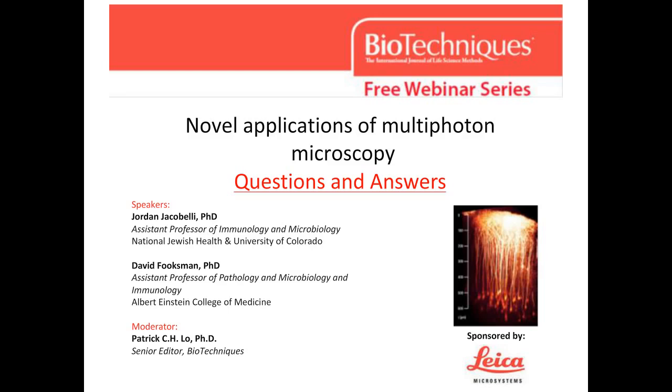Hi. We have several questions. One question is, I think both Jordan and David could try to answer. Can two-photon imaging be used on already frozen tissue after sectioning and prepared slides, especially brain sections? Would that be a problem?